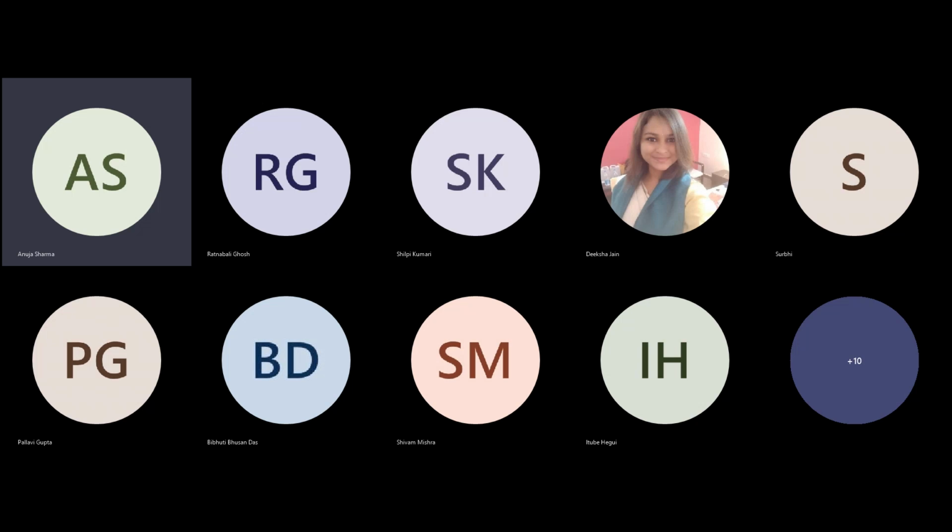Okay, it actually doesn't really matter because ATG also codes for an amino acid, right? If you see the CDS, ATG can function not just as a start codon but also code for the amino acid. Here I have incorporated it, but since the translation would already start from the His tag, even if ATG is present in the sequence, it won't make any difference as such. Okay, yeah, thank you.